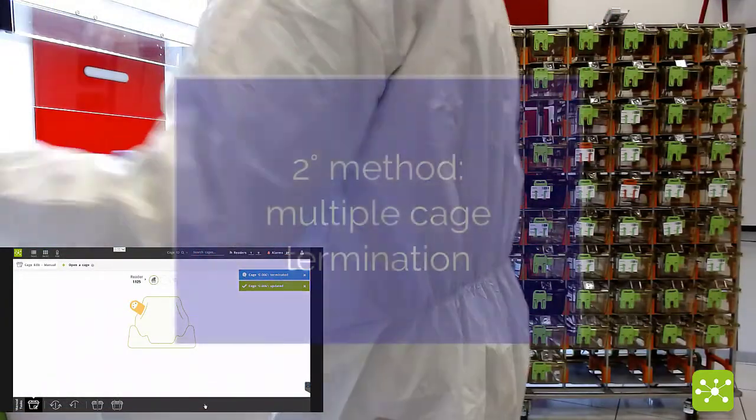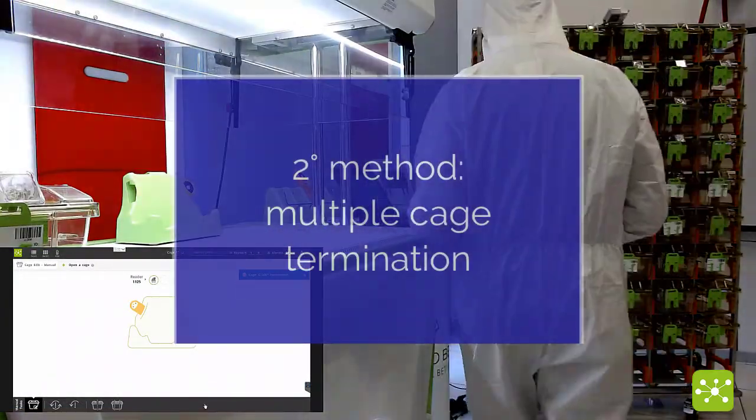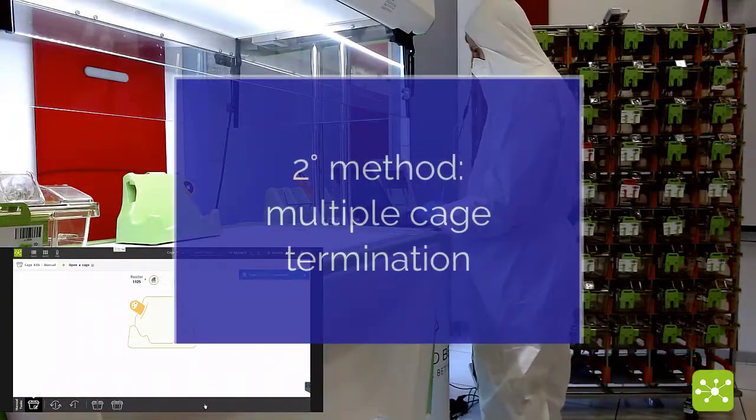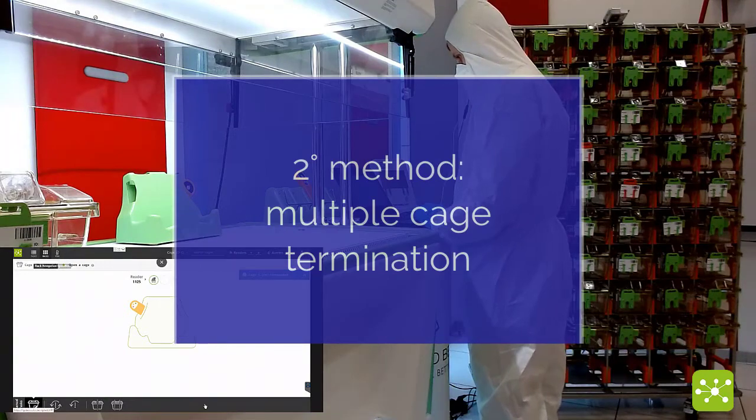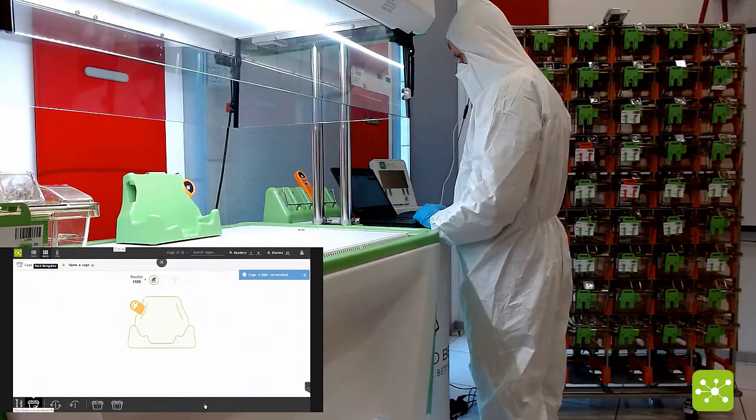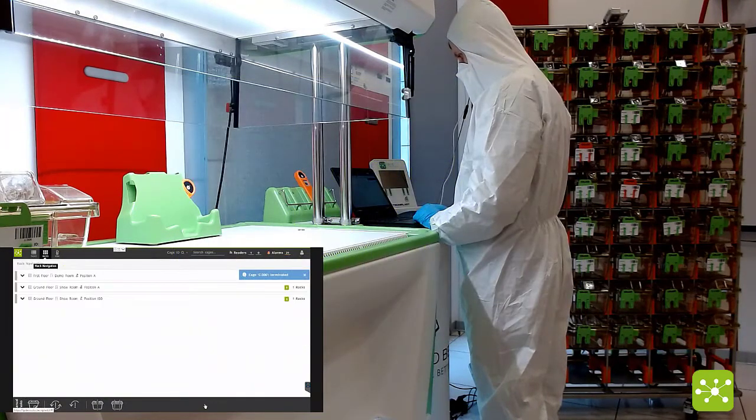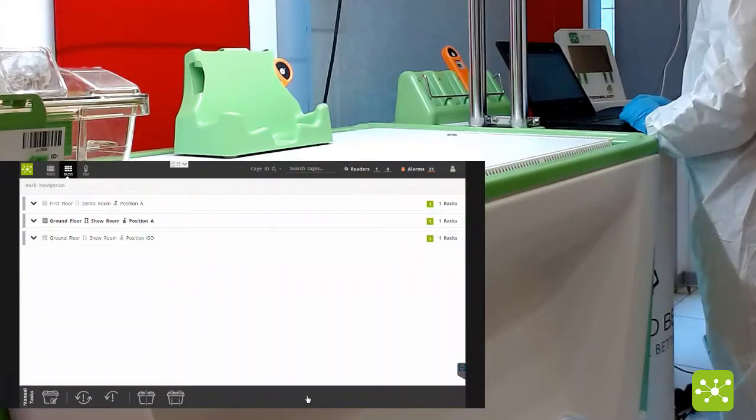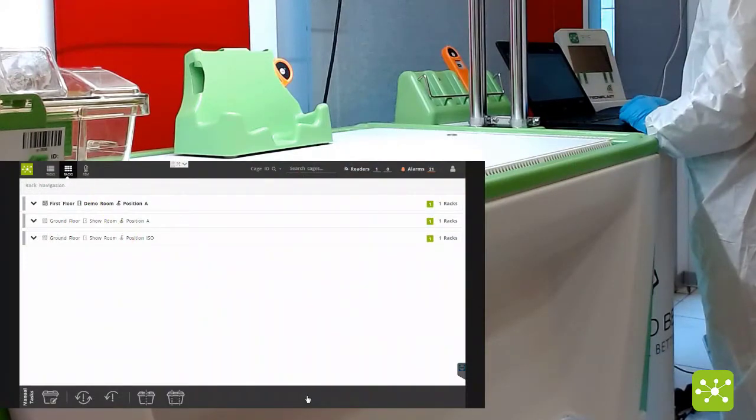Second way you can terminate a group of different cages, simply clicking on the rack icon located on the top left side.